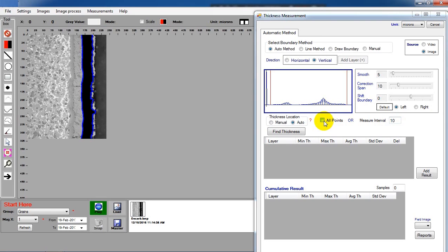All points means coating thickness should be calculated at all points on the boundary. Manual means you can select the location by yourself.